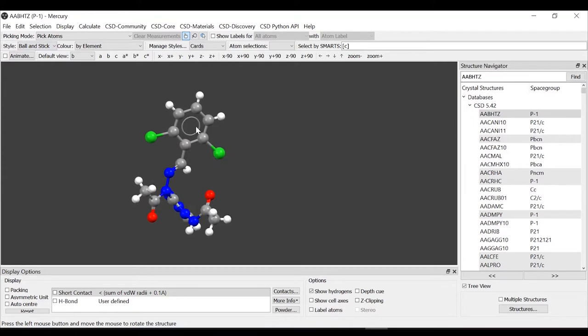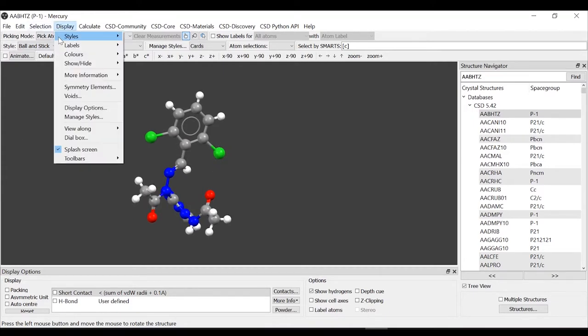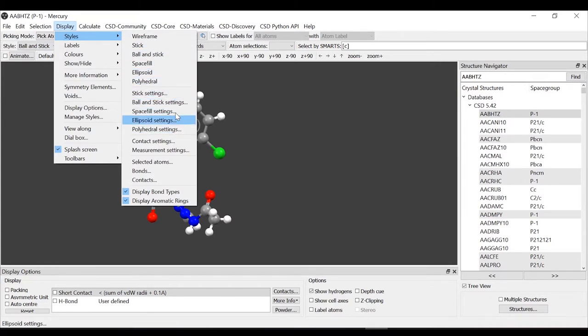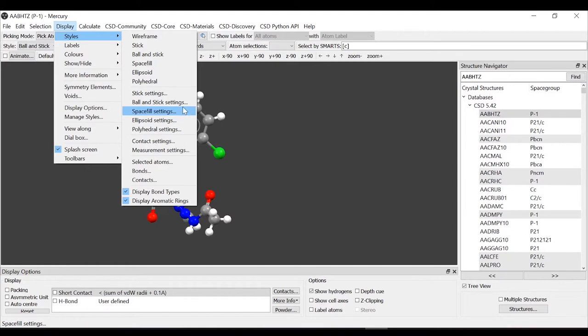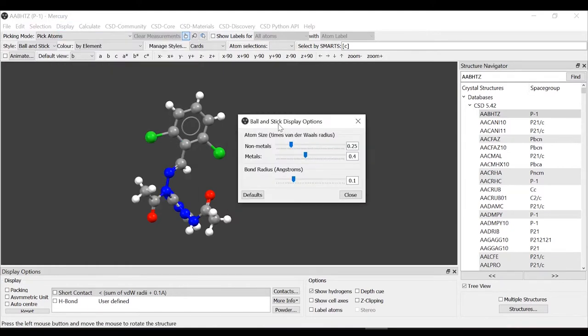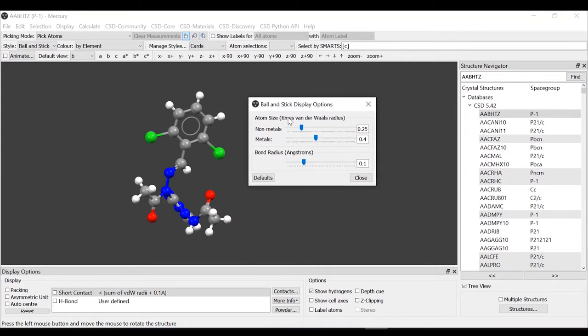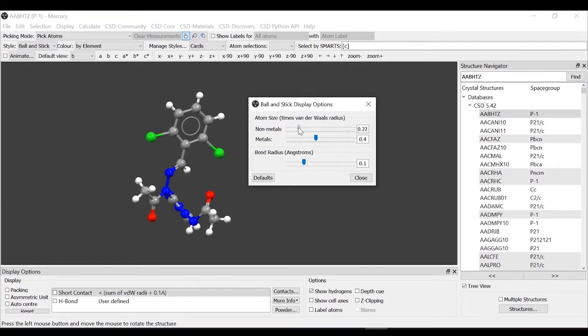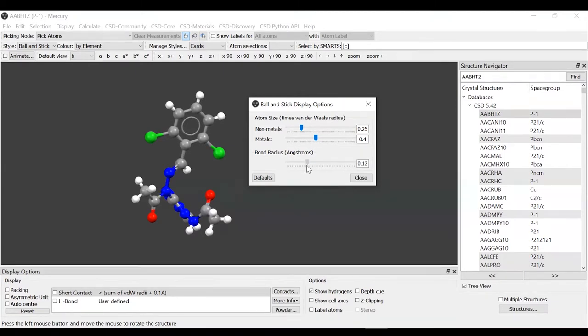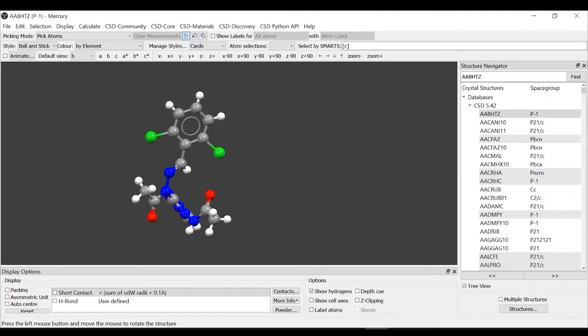We can change the settings for each of these. We're going to display styles. After the styles list, we have the settings option. We're going to edit the ball and stick settings. You can edit non-metals and metals separately. You can see how it changes on the representation. You can also change the width of the bonds. You can do personalization for each of the representations.